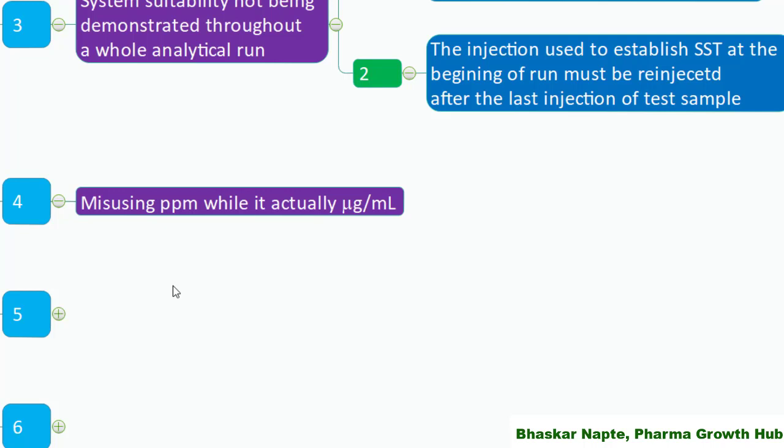Misusing ppm when it actually means microgram per mL — it is very habitual to use ppm as a synonym for microgram per mL, but these two are two different units. Rather than using ppm, you must start using microgram per mL. After understanding this common error, one should change this habit and start using microgram per mL rather than ppm.